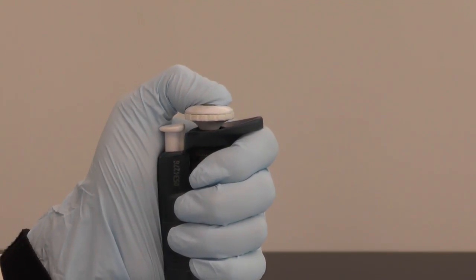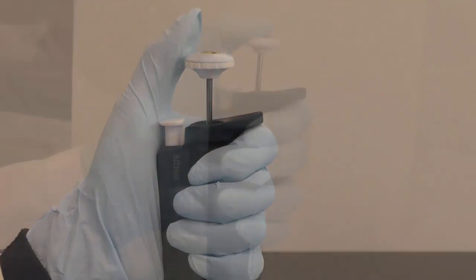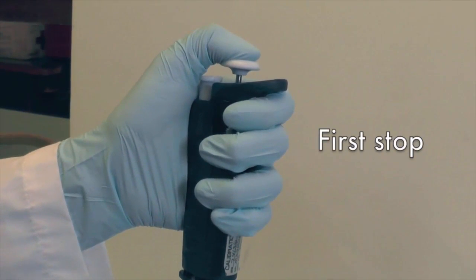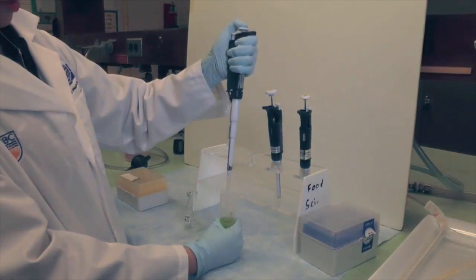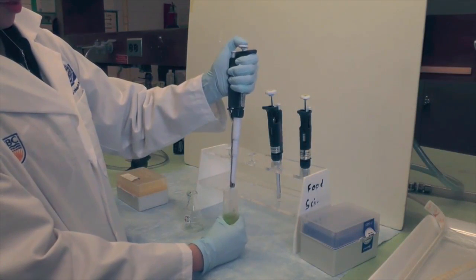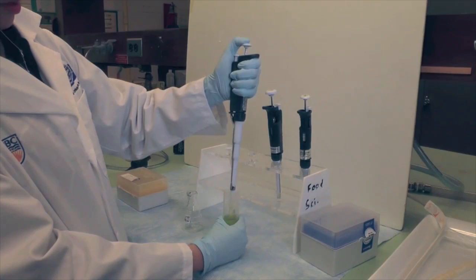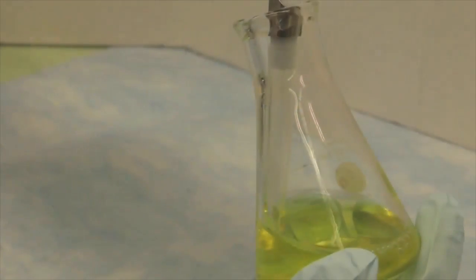There are two stops when operating a pipetment. To draw up the liquid, press the push button to the first stop. Insert the pipet tip halfway into the liquid, then slowly release the push button to draw liquid into the tip.